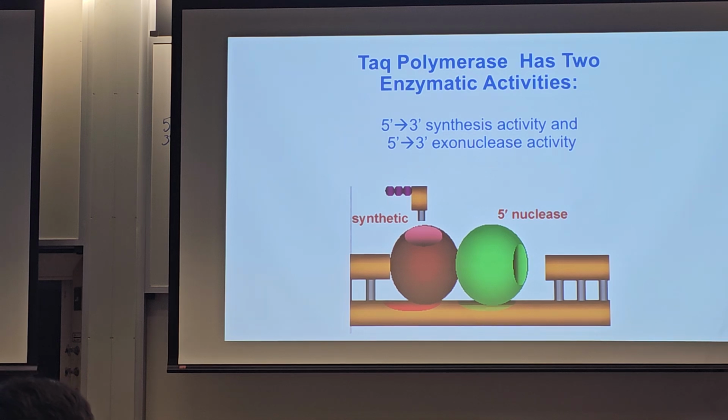So this shows how the Taq polymerase works. So this is really a weird diagram from Applied Biosystems again, so let me explain what we're looking at. This represents one strand of the double helix. This would be the primer that's hybridized. So this would be the 5' end of the primer down here. This would be the 3' end.